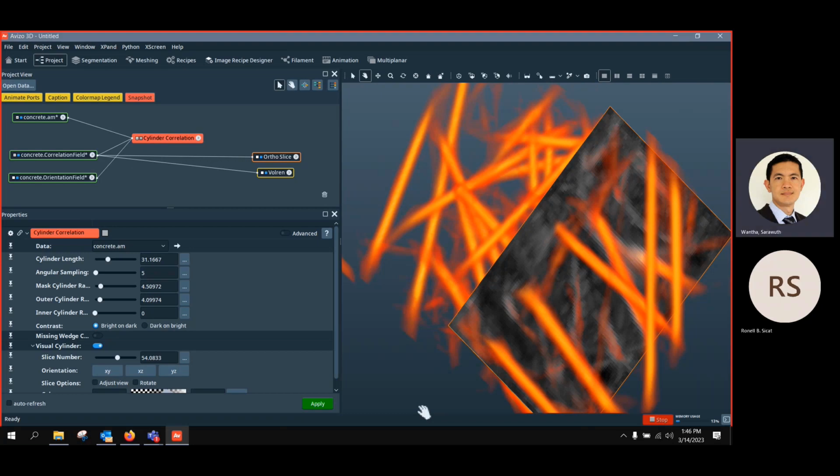So how can you detect other adjacent fibers? You have to define what's called the search cone, with its angle and length. It's very important that we can define that. If you estimate it here, you detect this one, and for the next one you define the same, so you detect the next one. You just start to connect the seed points together on one correlation line. I hope that's okay.